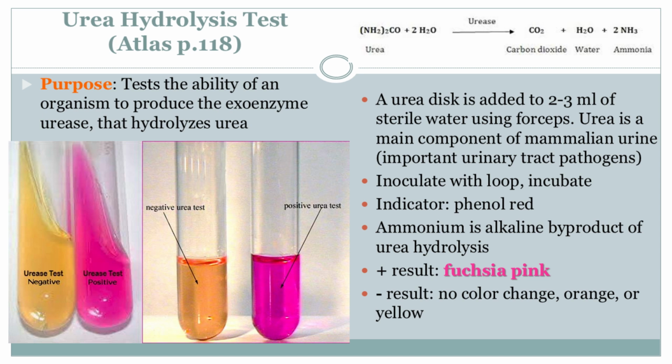That's amazing. Now, on the other hand, let's talk about E. coli. E. coli, I've heard of that one. Isn't that also a common cause of UTIs? It is. But here's the thing, E. coli doesn't produce urease. So even though they can both cause similar problems, this test helps differentiate between them. Absolutely. And that's crucial for doctors. Because knowing which bacteria is the culprit helps them choose the most effective treatment, right? Precisely. It all comes down to understanding how these tiny organisms behave and what makes them tick.